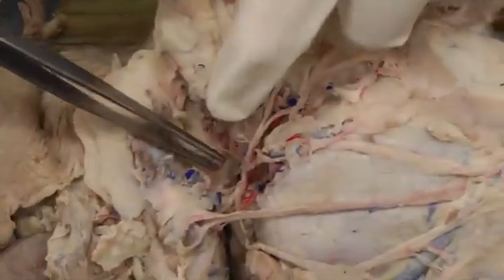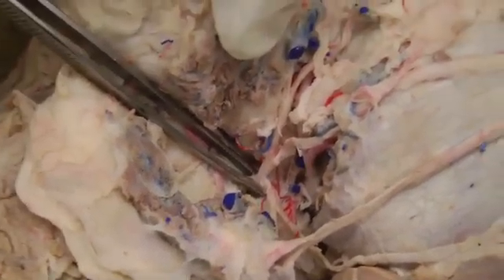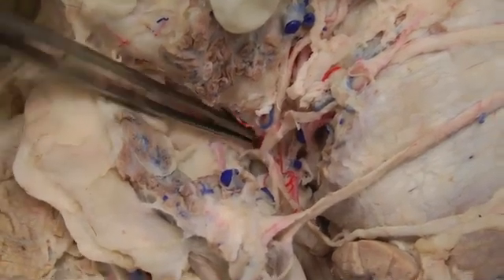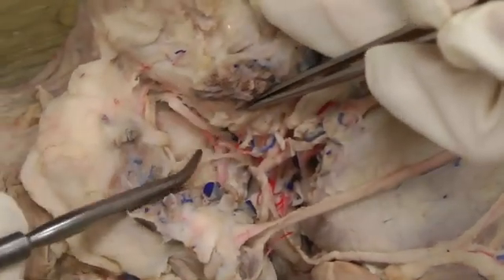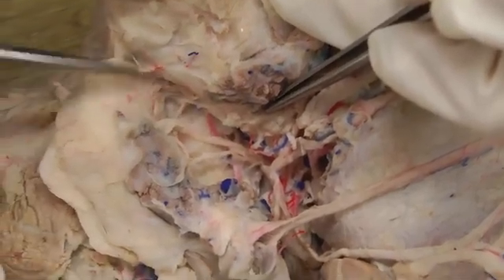If I stick the forceps way down in here, this big part that the forceps is around is going to be the facial nerve. The facial nerve is giving off a bunch of branches that we're going to identify now. It kind of swings around the base of the ear and gives off some little ones right here that are going to be caudal auricular nerves — or caudal auricular branches — going just to the back of the ear.